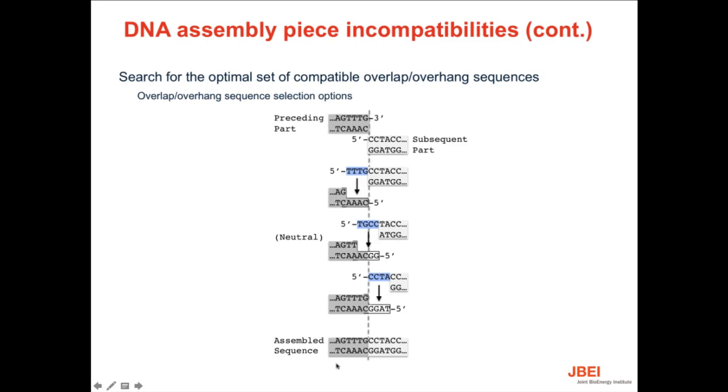So this is really key for several reasons. One of the reasons is that if you can shift around the overhang or overlap sequence and still get the same sequence, that allows you to make sure that the overhang or overlap are in regions where, for example, in a combinatorial assembly process, there's lots of sequence identity, so you can really maximize the reuse across all of your combinations.